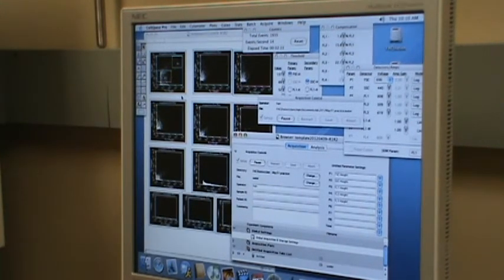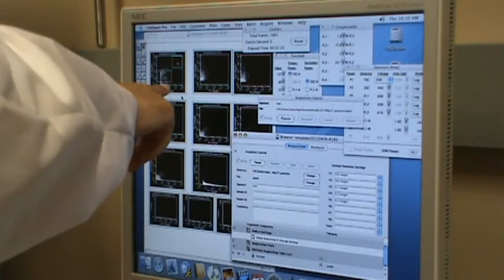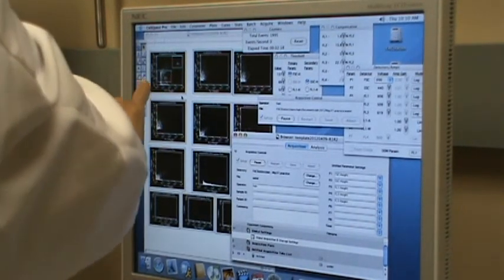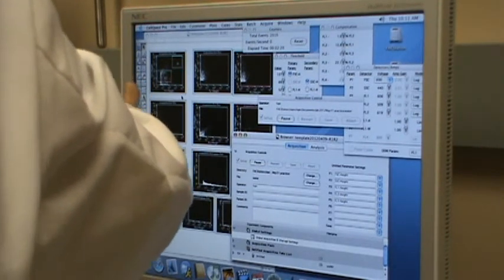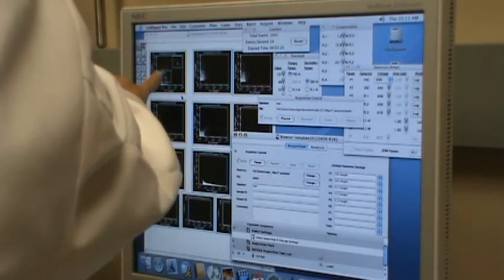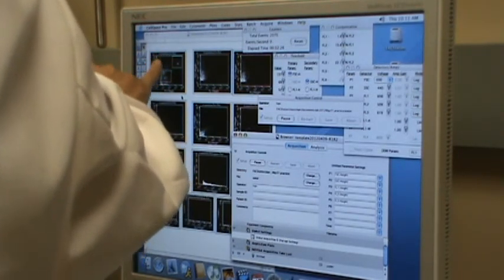I forgot the term. Okay, but in this case you can see there's a lot of dust in that water. That water looks clear, but there's so much dust that you will see here. Those are on log scale, so you really need to pay attention to the scale. Those are log scale, 10 to the 4, 10 to the 1. So that means it's a very small particle on this side.